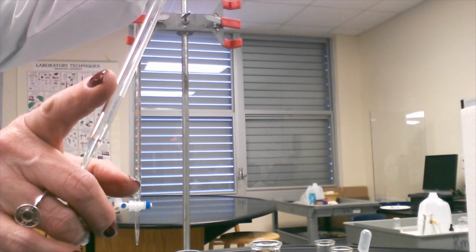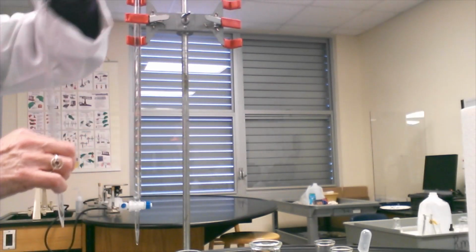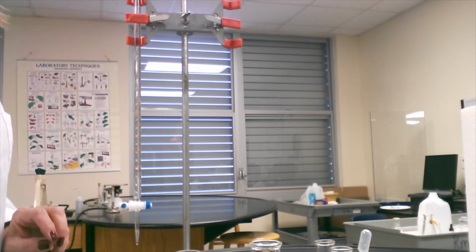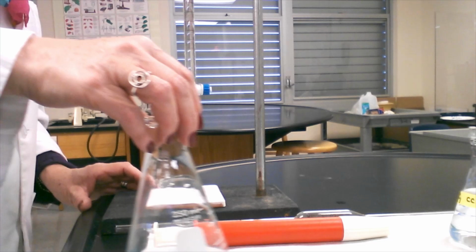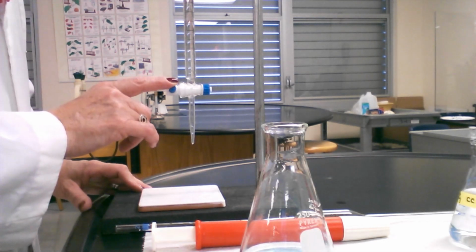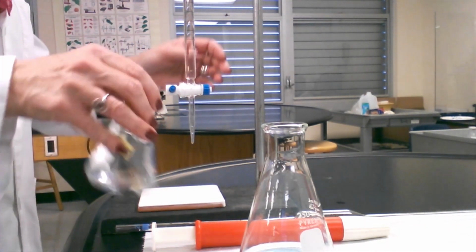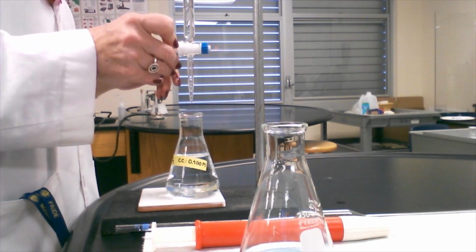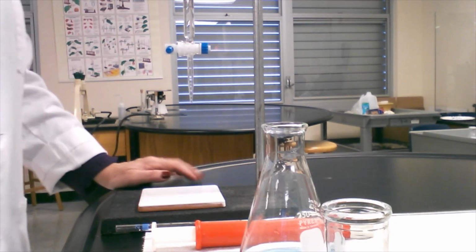Now, the liquid that stays here is supposed to stay there. That's why it's called a volumetric pipette. So, now we are ready to go. We have already filled the burette with the thiosulfate, and the concentration is 0.1 molar, so we record before beginning the amount that we have. We're going to release a little bit of thiosulfate so it overpasses the zero, and we record the first measurement.